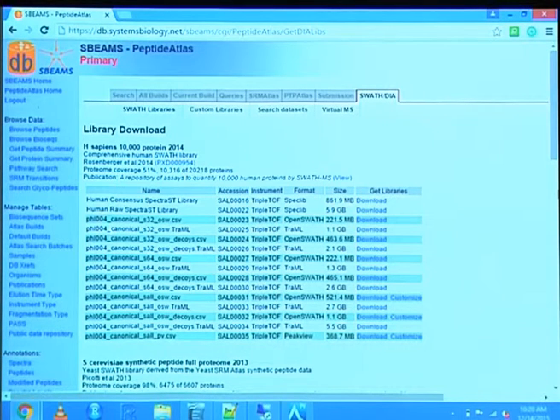You could download here the consensus SpectraST library, add the virus library, and then make your assays like that. The raw library here is useful if you're using human yourself, and you think if you make the assays, it's better than if we do that. And like this, you could combine the libraries a step earlier.